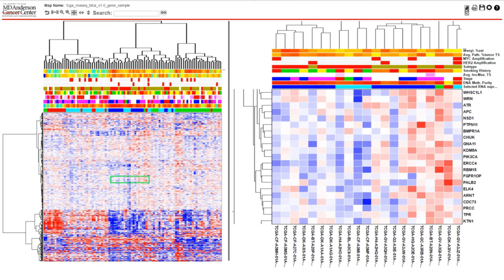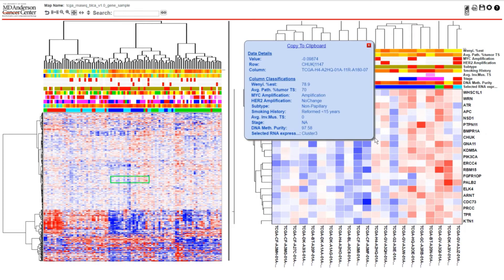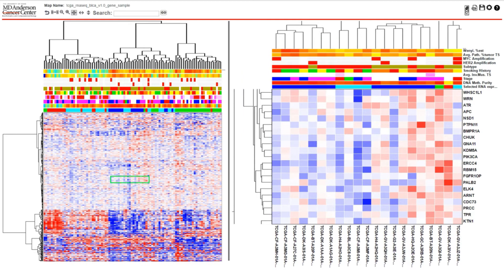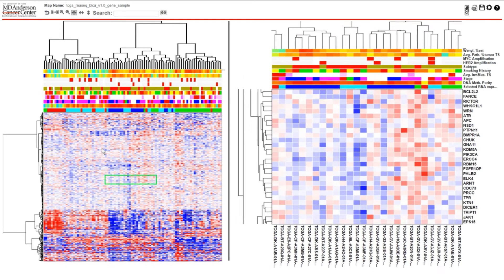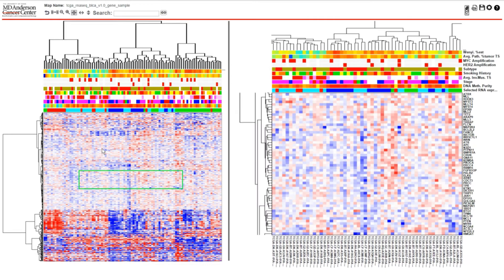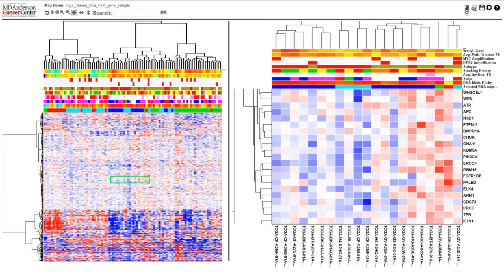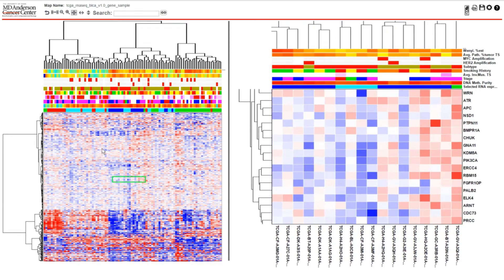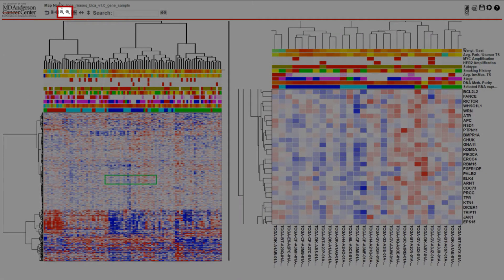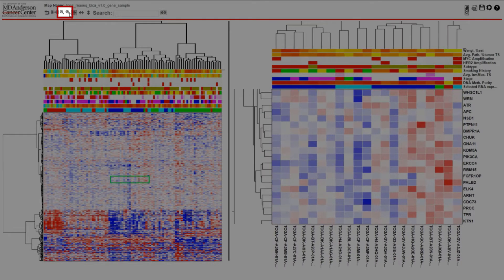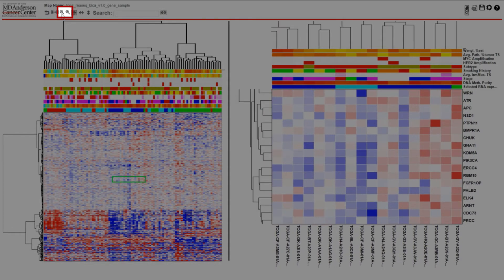To see the information of a particular data point in the detail view, just click on it. To adjust the zoom level, you can use the scroll wheel on your mouse to zoom the detail panel in or out. Alternately, you can use the zoom in and out icons on the icon panel at the top.